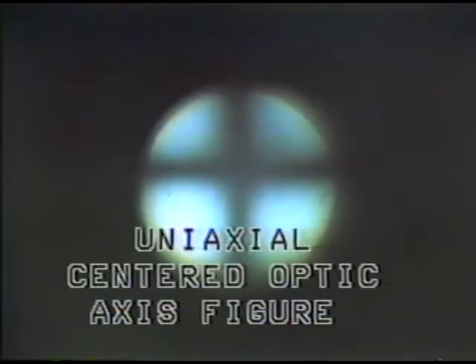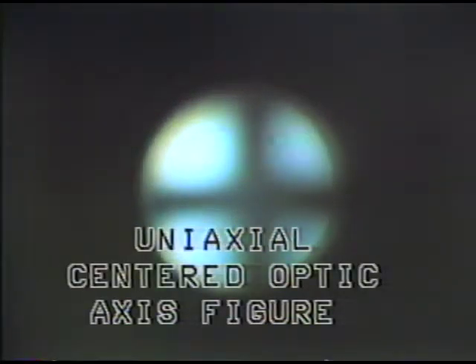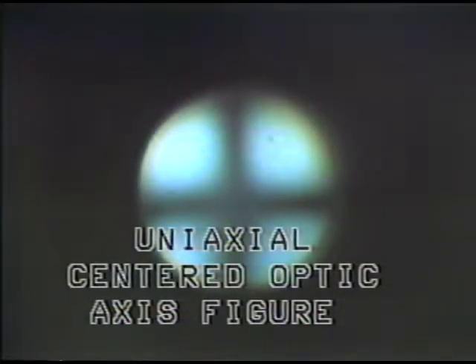This kind of figure is called a uniaxial centered optic axis figure, or it can be abbreviated as a COA figure. And this is the kind of figure that is obtained when the C-axis is perpendicular to the stage of the microscope, or when we're looking at the circular section of the uniaxial indicatrix.